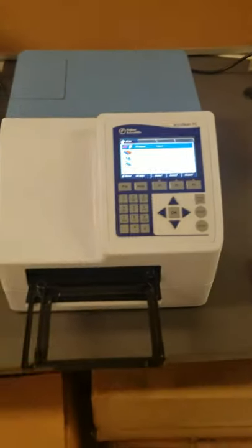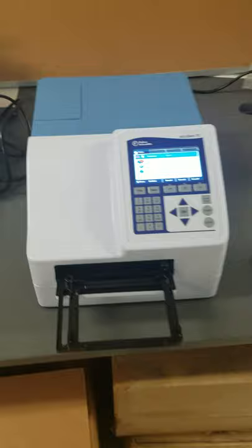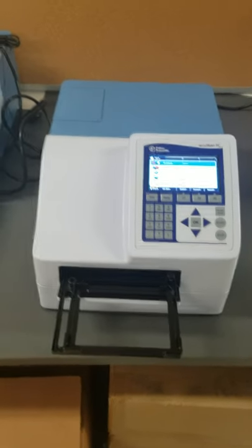First thing we want to do — as you can see, this one's already turned on — but we want to go to the back and flip this switch to turn it on. It will run some initial diagnostics, and the plate loader will automatically come out. So all I've done so far is flip the switch.